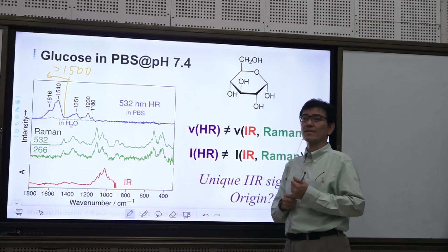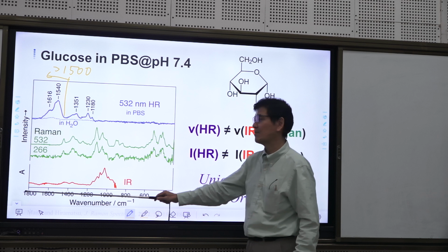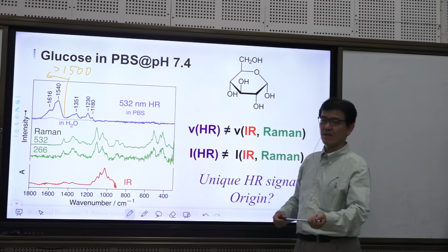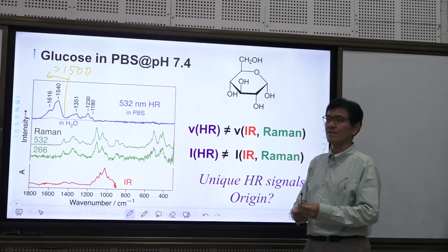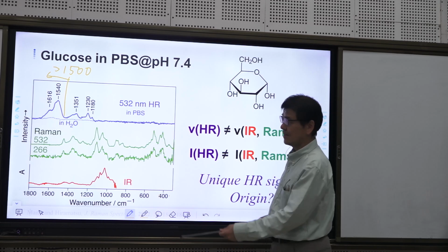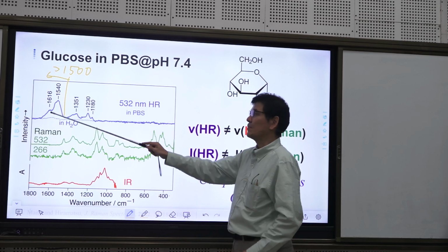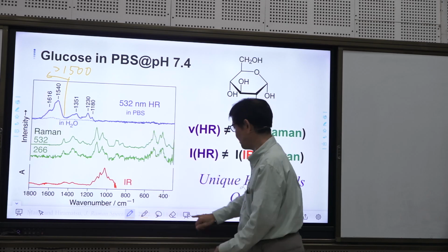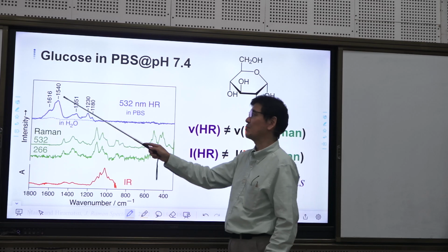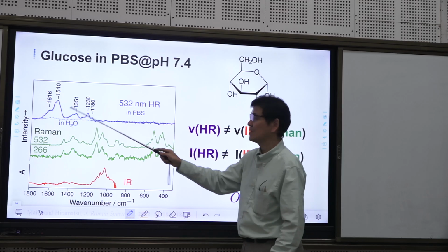First, I asked the student, did you do wave number calibration properly? And he replied, yes, I did, as you taught. Okay. Then I checked, and it was reproducible. So we have to consider what is the origin of these peaks.